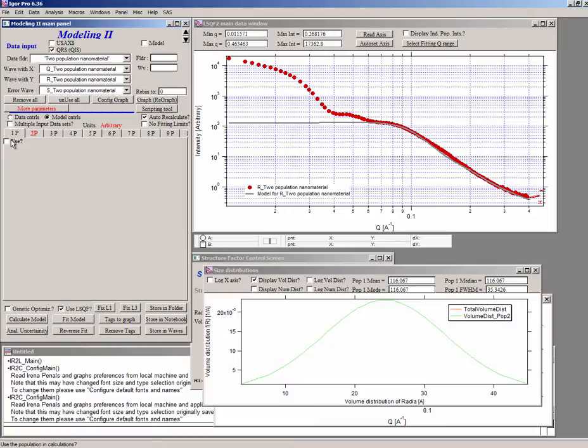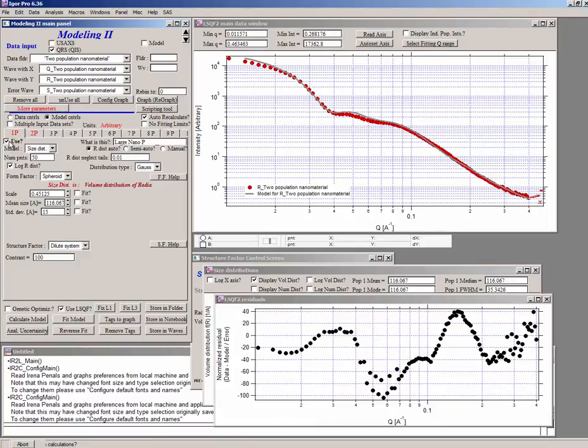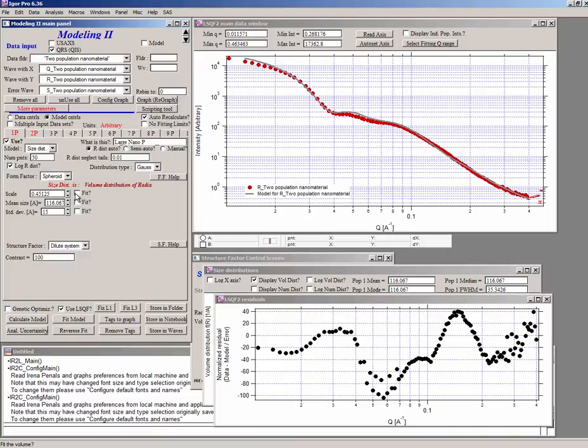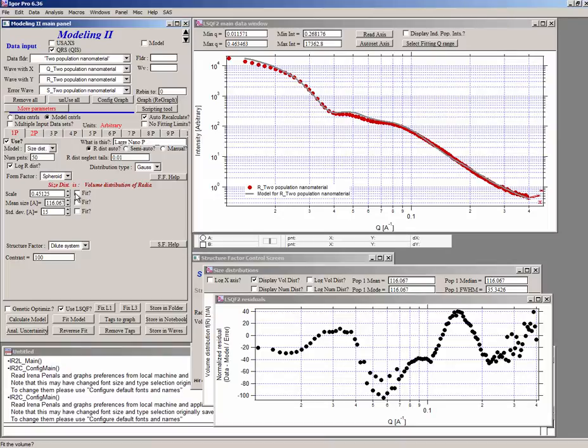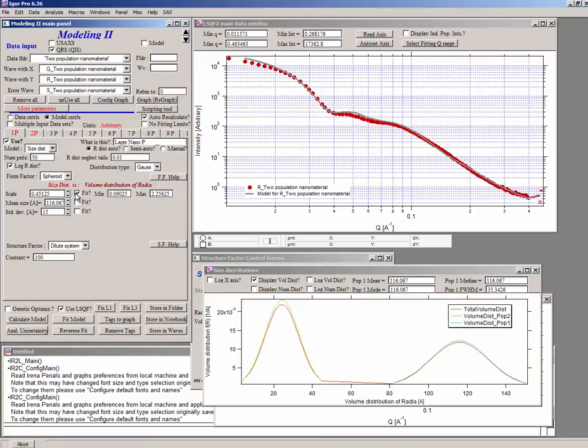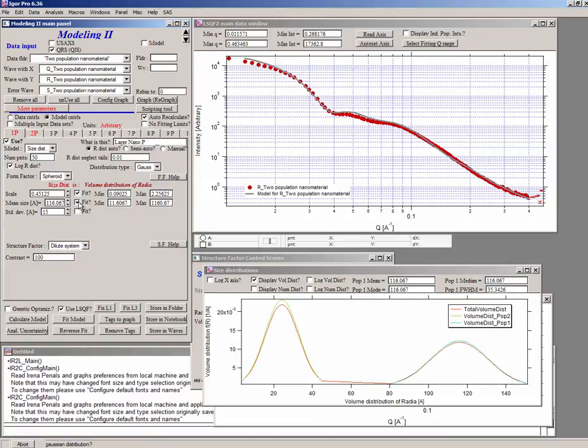First thing is, let's switch on back this population here. The first population. And let's pick some parameters to fit. Do not start with fitting all the parameters at once. You always have to start with fitting just a few parameters and the ones which dominate most. So typically, scale will fit, will dominate. And in this case, let's pick mean size. And let's leave the standard deviation unchecked. In this case, scale is important. Mean size may be important. And I would pick the volume fraction in here.